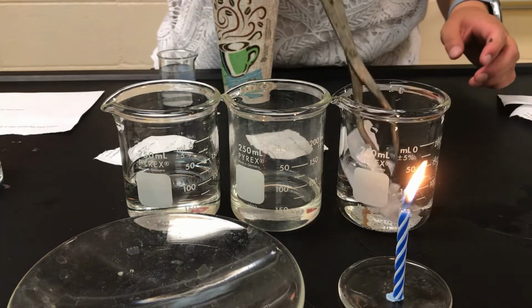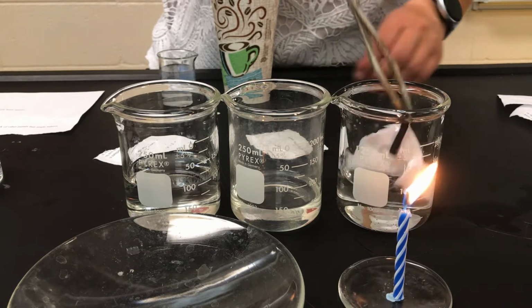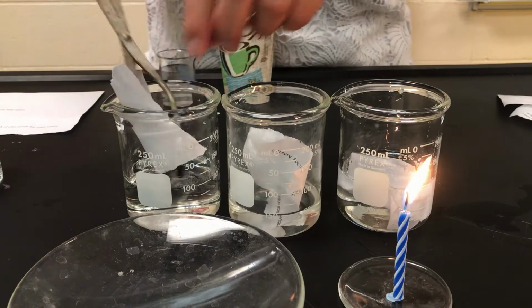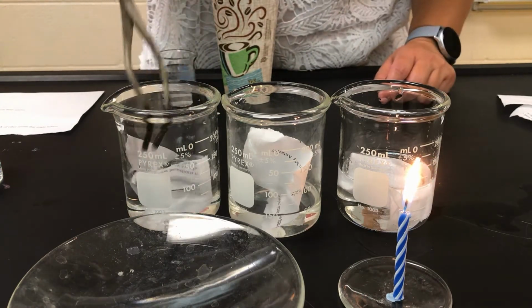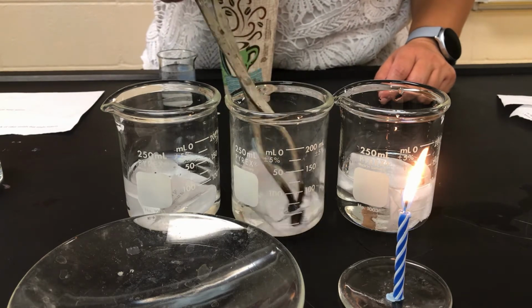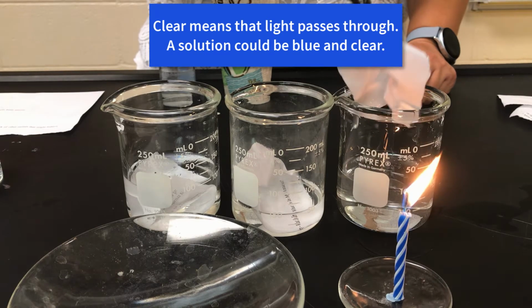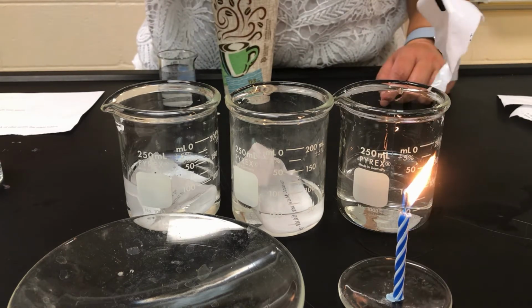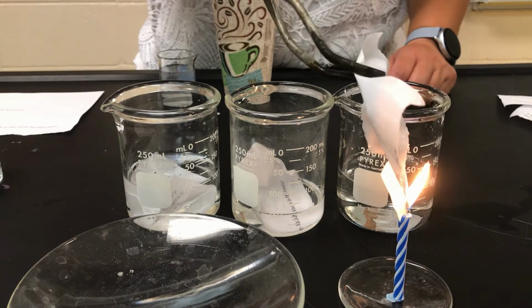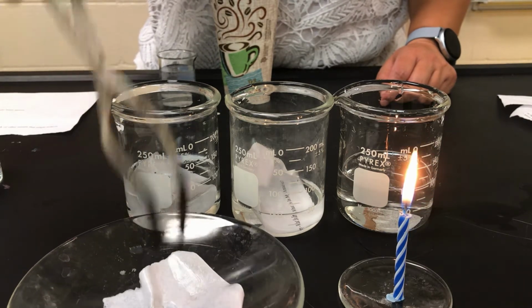So here we have 3 clear, colorless liquids, and we are taking some plain old paper and putting it into each of these beakers of 3 clear, colorless liquids. And you'll note that there is a candle to provide a flame. And then now we're going to take that paper from that first beaker and we're going to expose it to the flame. And what do we observe? Nothing. Nothing is the answer. Nothing happens to the paper, right? So what can we say?